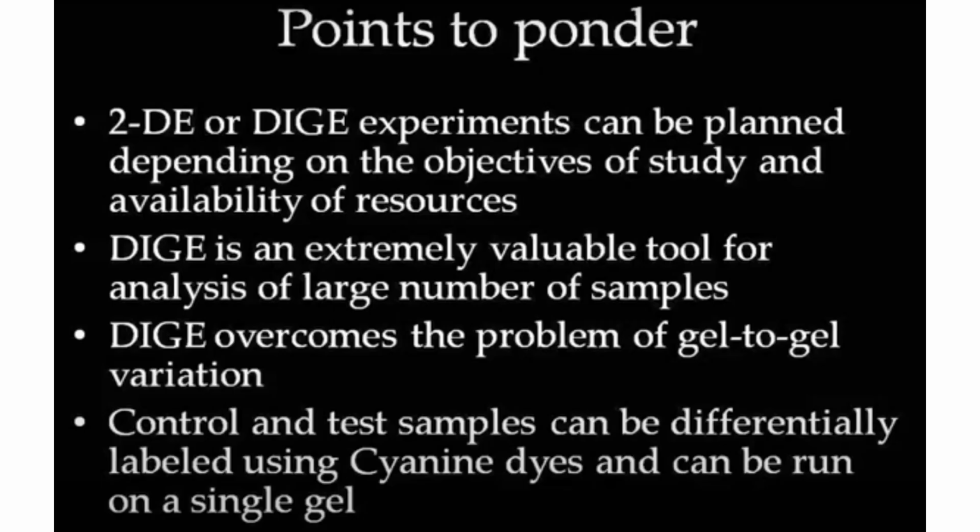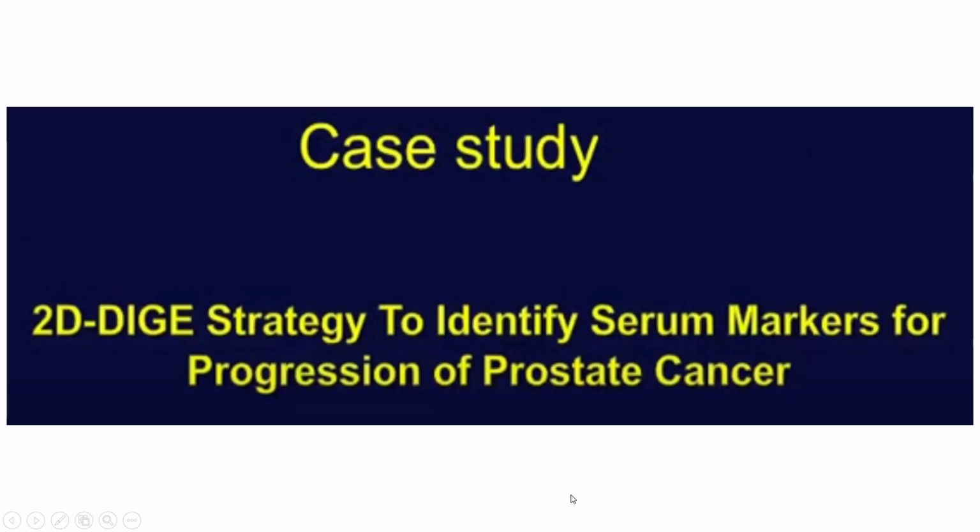All those can be analyzed using that specific software. So it's an extremely valuable technique. It can analyze a large number of samples. It can overcome the problem of gel to gel variation, etc. So now Sir discussed a bit of case studies as well, wherein Sir talked about how exactly this DIGE technique can be used for doing analysis.